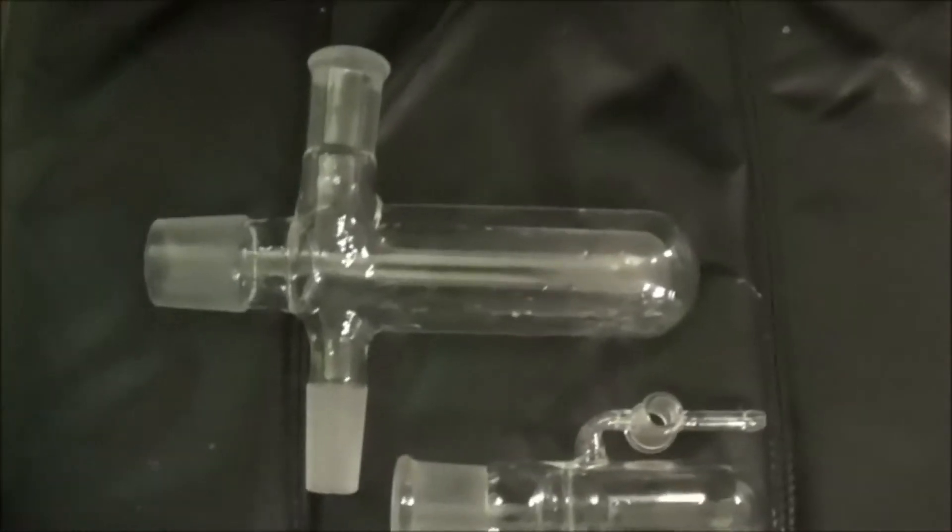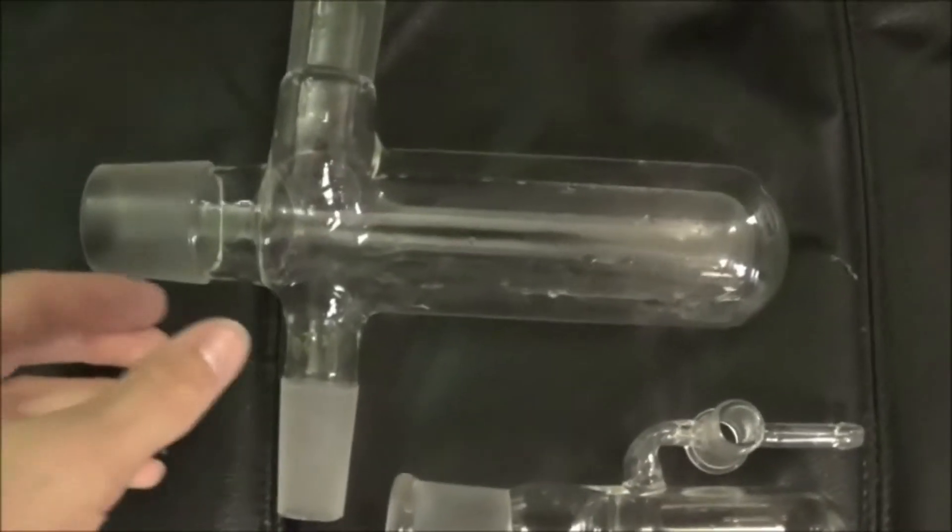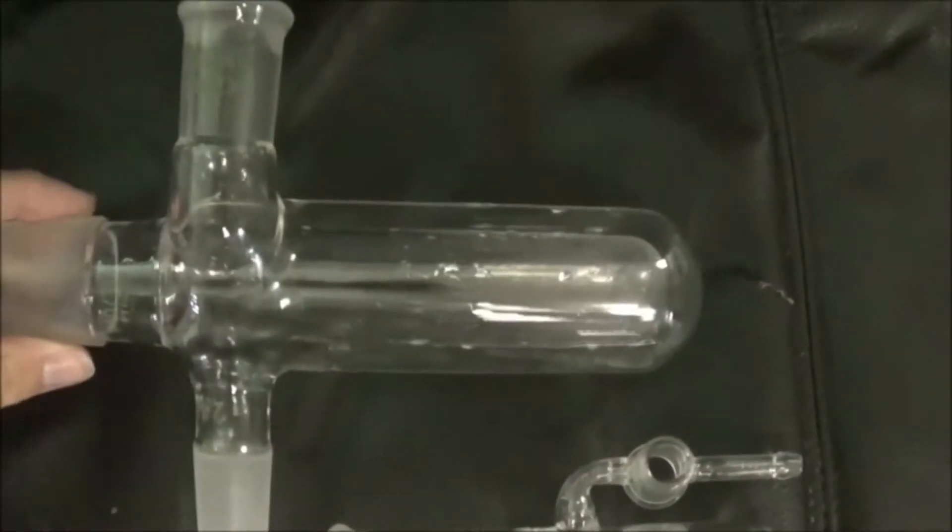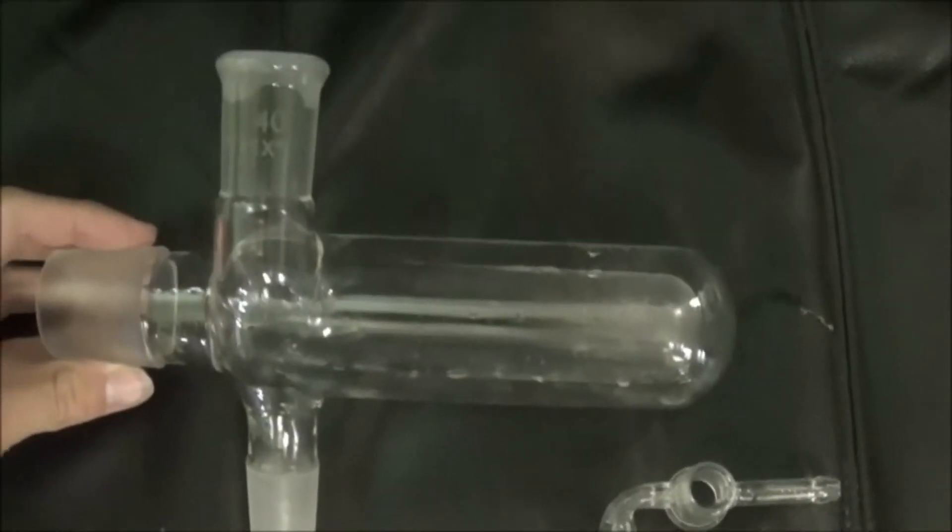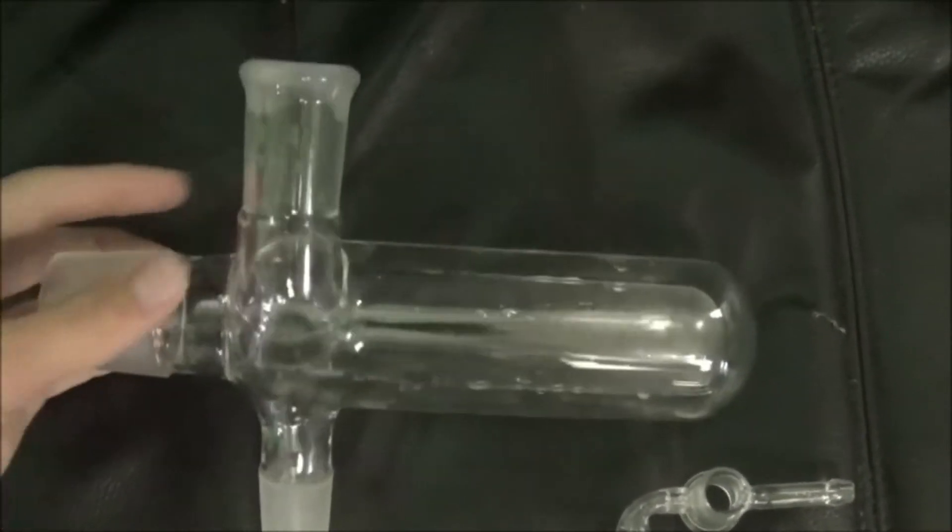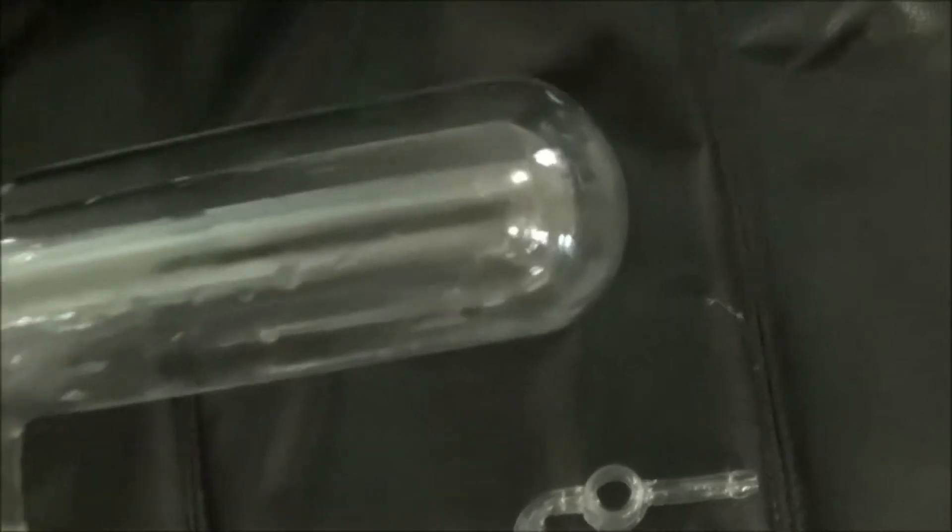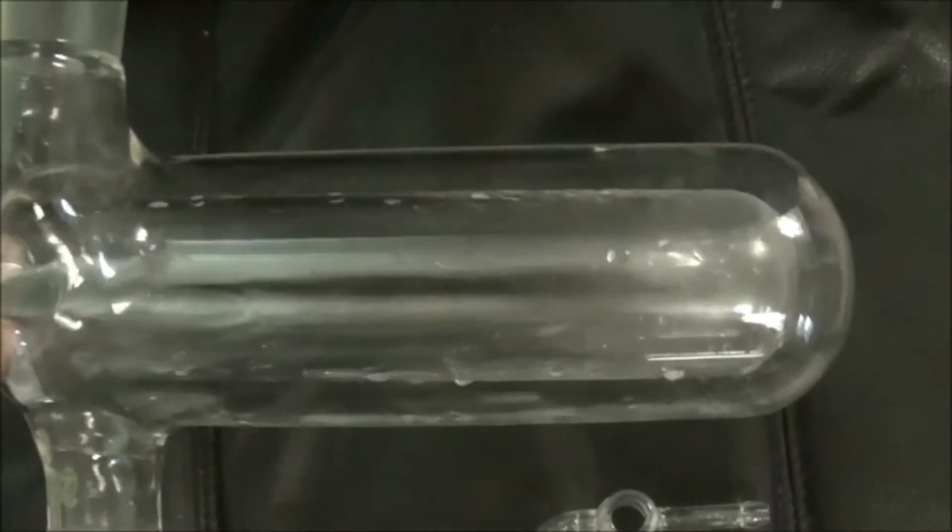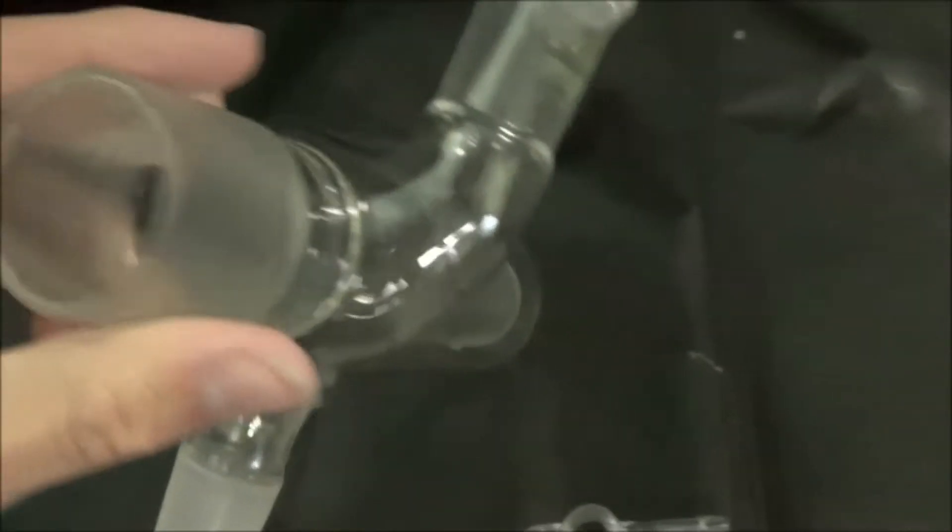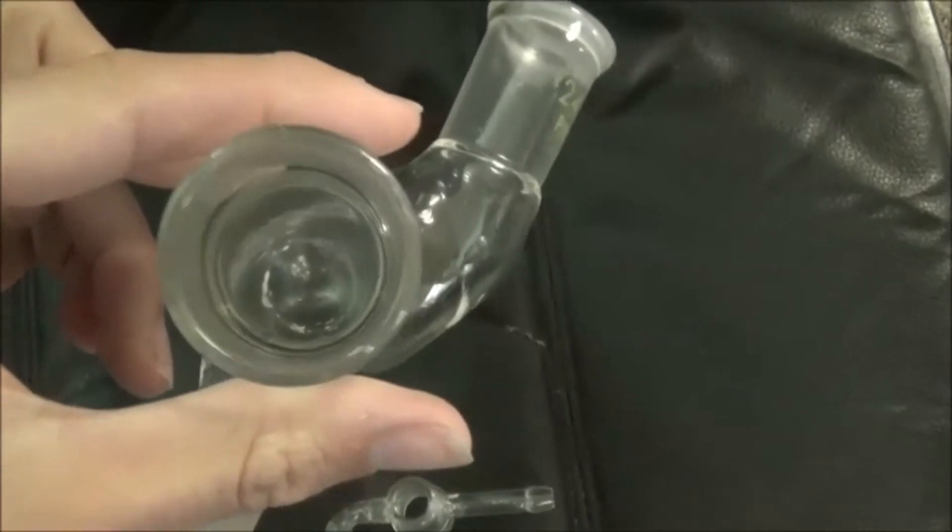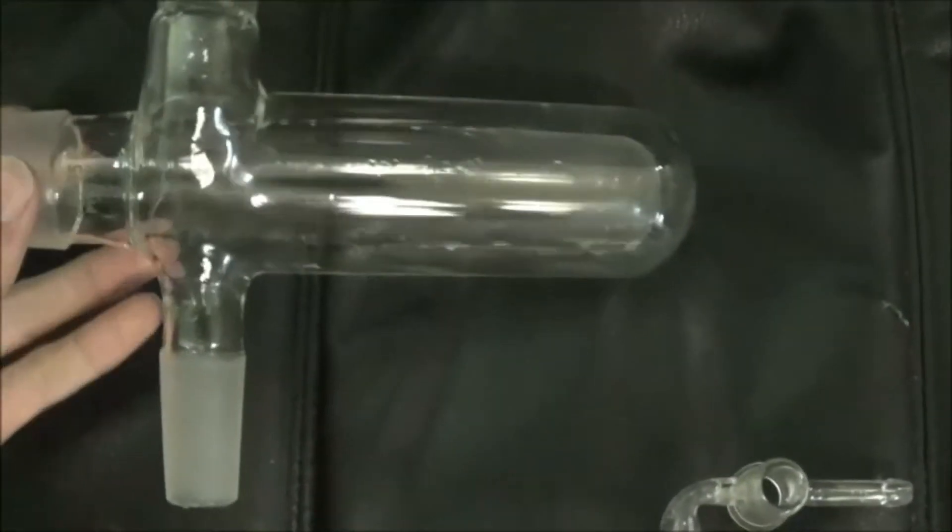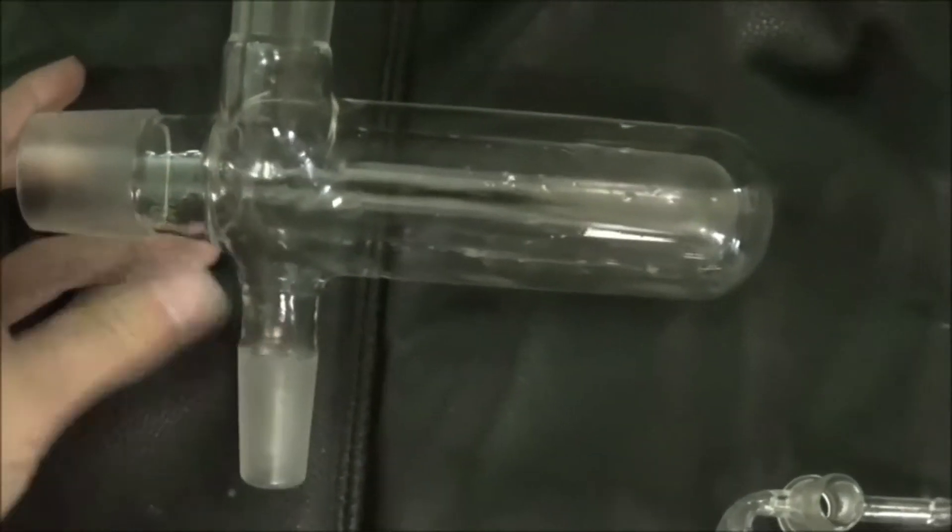It is made up of two parts. The main body is shown here. Notice the inner and outer glass tube on the right. The inner tube is where the sample to be dried is placed. The outer tube is connected to the bottom and top joint. A flask is placed on the bottom joint and a condenser is placed on the top.